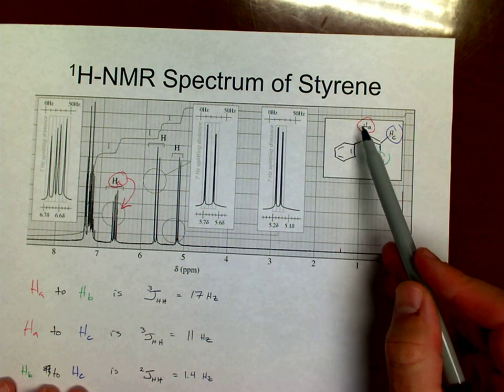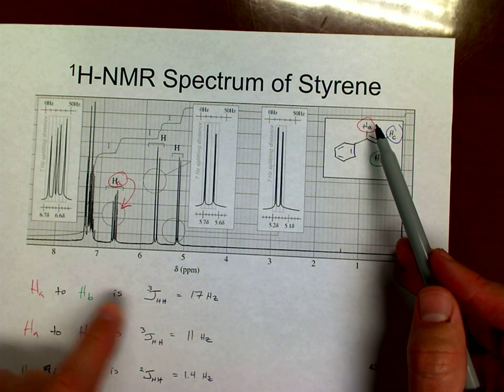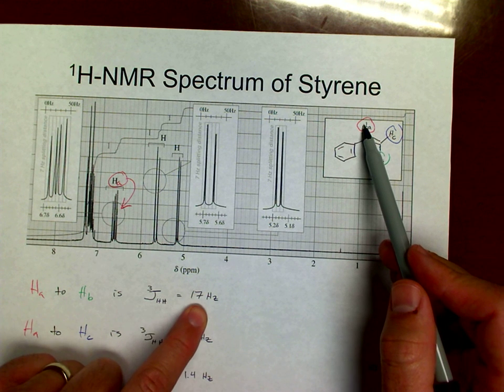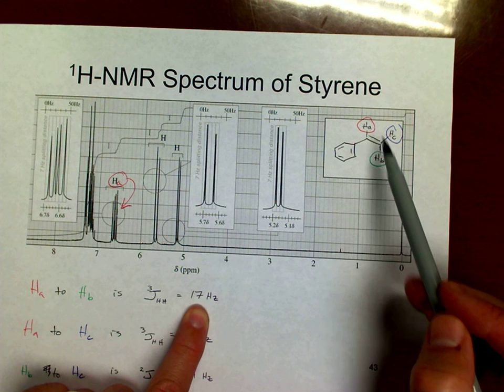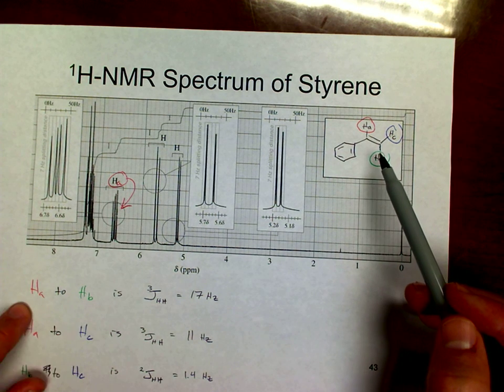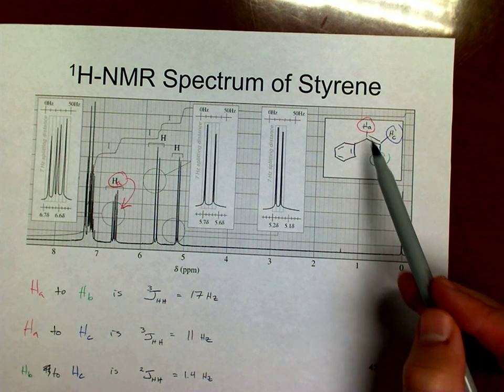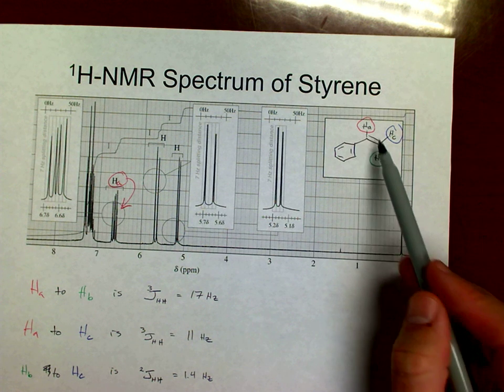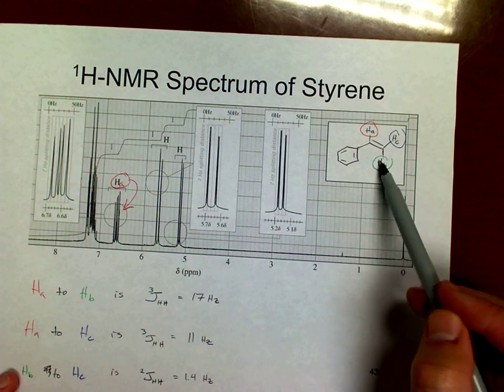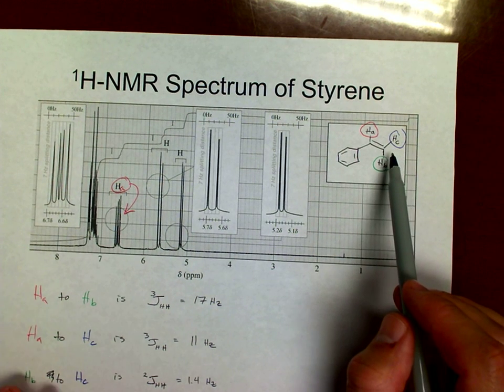So HB to HA, if HA is coupling to HB at 17 hertz, HB is coupling to HA at 17 hertz as well. Okay, so this goes both ways. So HB is a doublet because it sees HA. But then each one of the signals of the doublet has to split again to HC. So it also goes to a double doublet.